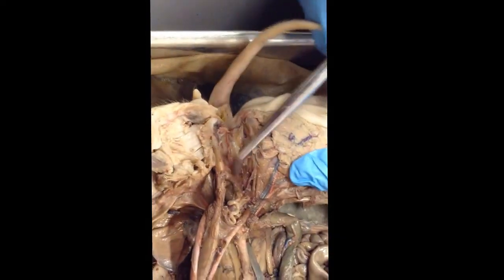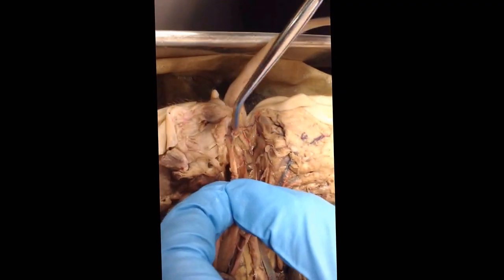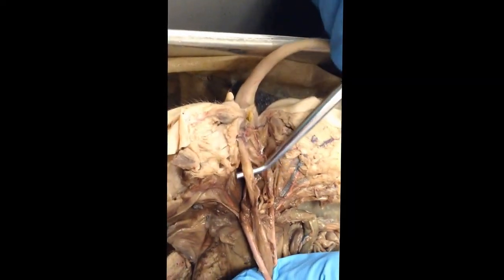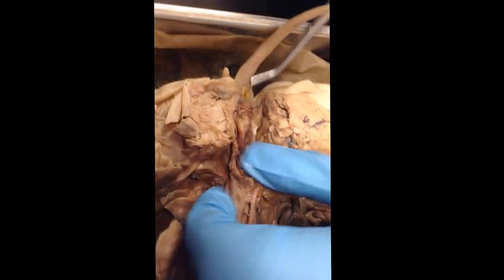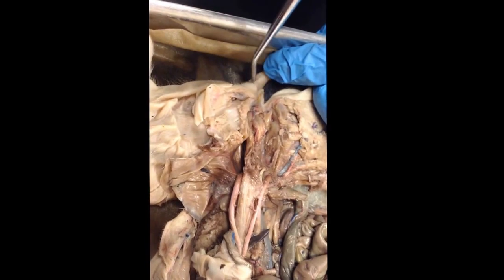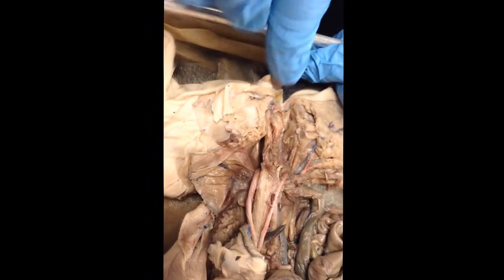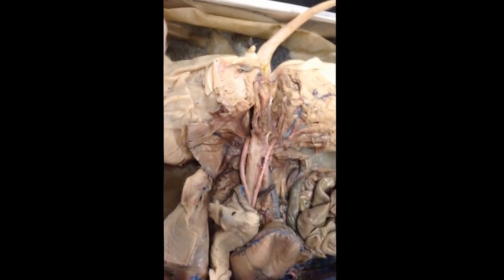It's not really clear. Just this area, and then it all comes out. Then this is the urethra. So urethra, then down here's the vagina, and it all comes out the urogenital opening, and then these are the labia. So that little lumpy thing, it's the flaps. If it's pointing to the outside, it's a labia. The labia are the flaps, and then the opening is the urogenital opening.